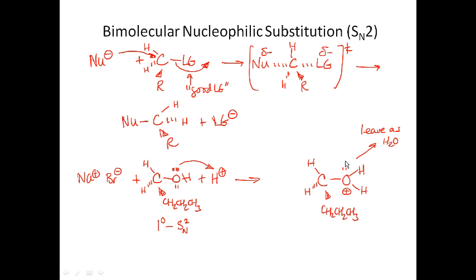And so now the bromide will be able to come in. Of course, it's going to take a little bit of heat to do this reaction, 45 minutes worth of refluxing heat. But now the bromide will be able to come in, attack this carbon, and then kick off the oxonium ion, and that's what this is called. I will write that down. This is called an oxonium ion. So it'll kick off the oxonium ion as a water molecule.